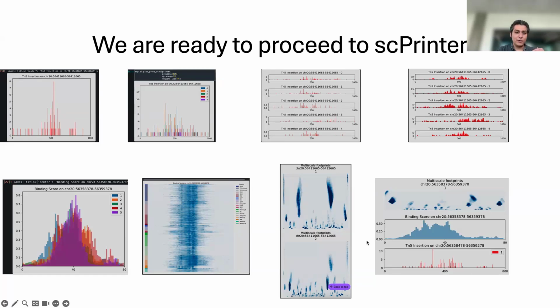And based off of that footprint, we can start to make inferences on what protein is bound to that specific DNA sequence. They call it multiscale because you can ask this question when your DNA viewer window is at the scale of, say, an individual motif, which is just a couple dozen base pairs.